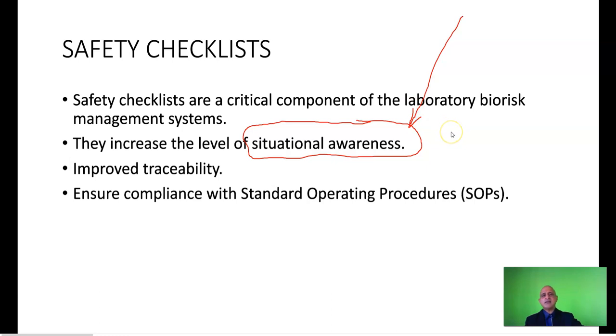Please be aware that working in a containment facility or a biological safety level 3 or 2 laboratory involves a high degree of situational awareness. And this situational awareness is determined by your focus and also your fatigue level and stress levels. For instance, if a laboratory procedure requires you to work for 3 hours, you must be aware of all the situations around you within those 3 hours. And if the biorisk manager decides that 3 hours is too long for a particular procedure, he or she may implement a shift system in which the first laboratory worker works for 2 hours and the next laboratory worker takes over from that. Now, this management of time and work schedules is very important in a containment facility, as fatigue and repetitive tasks can lead to a breach of containment.